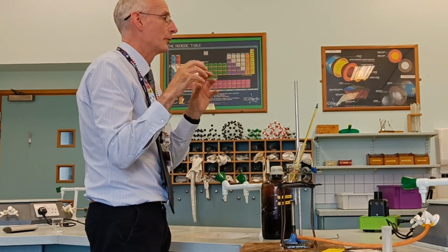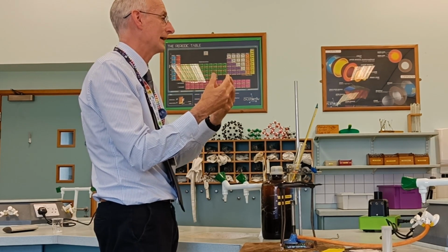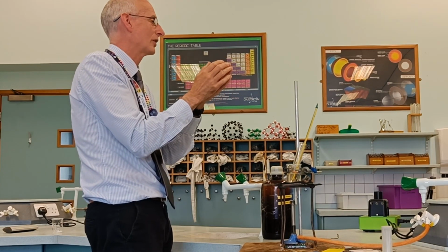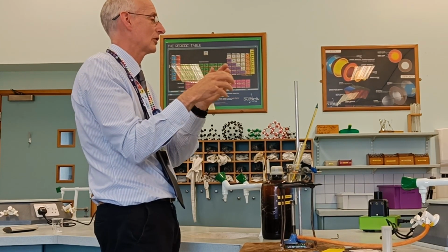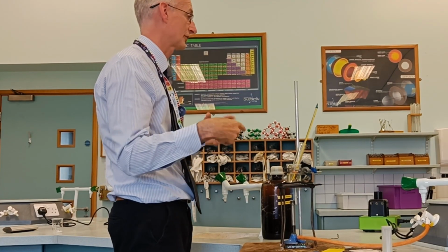Because the reason it's visible is you've got lots and lots of tiny crystals, and it's clearly nicely opaque. If you have a liquid which solidifies, it just solidifies in one big block, and you can't see those crystals anymore, it's a lot harder to see. So if you mess it up on the first one, then you have to start again.